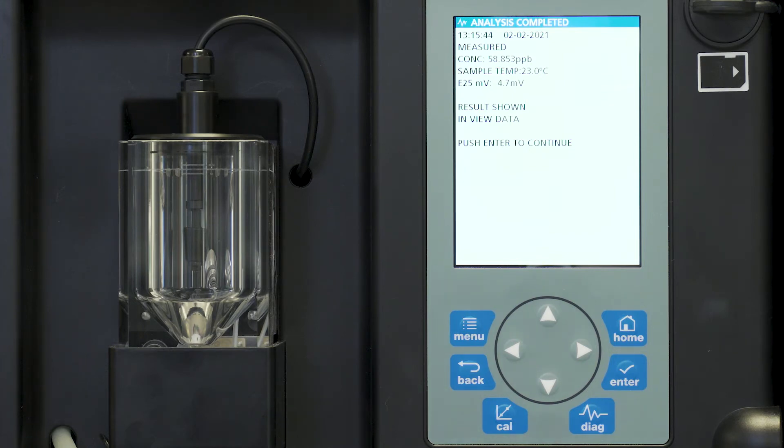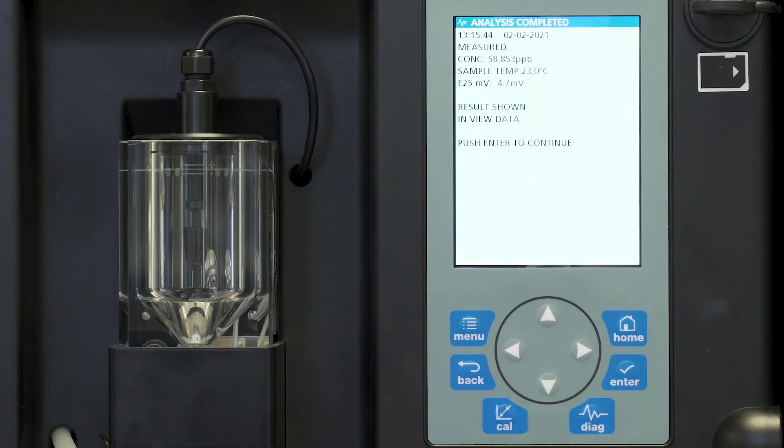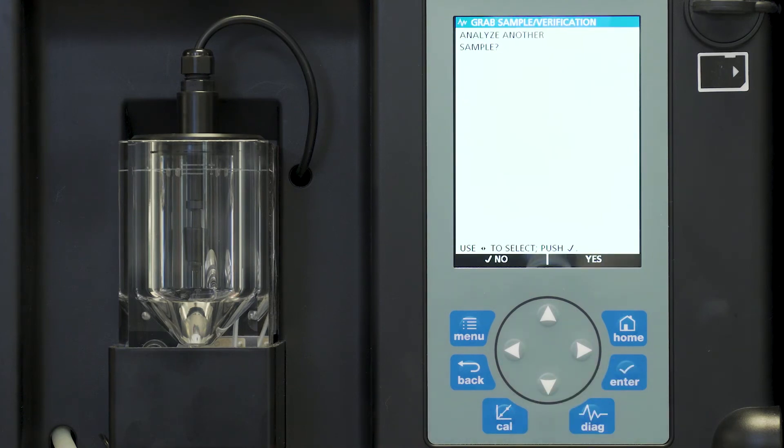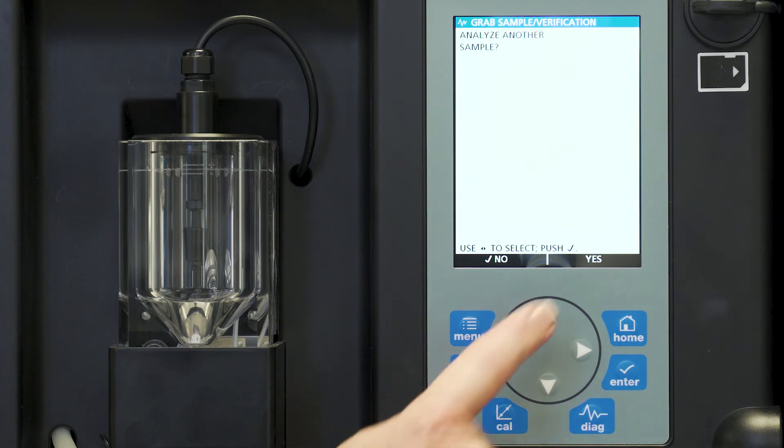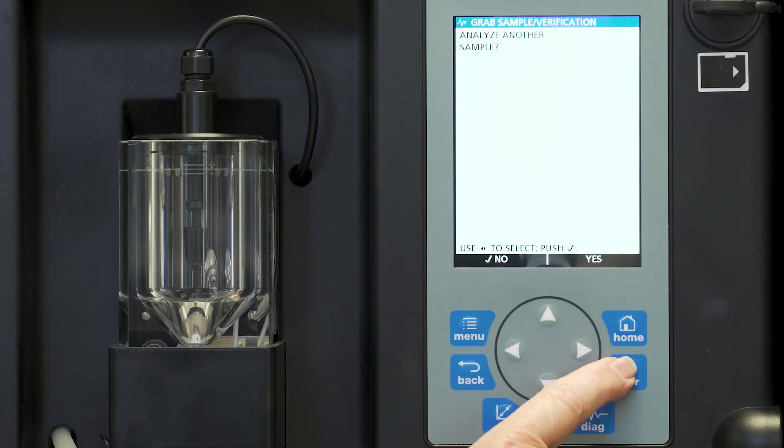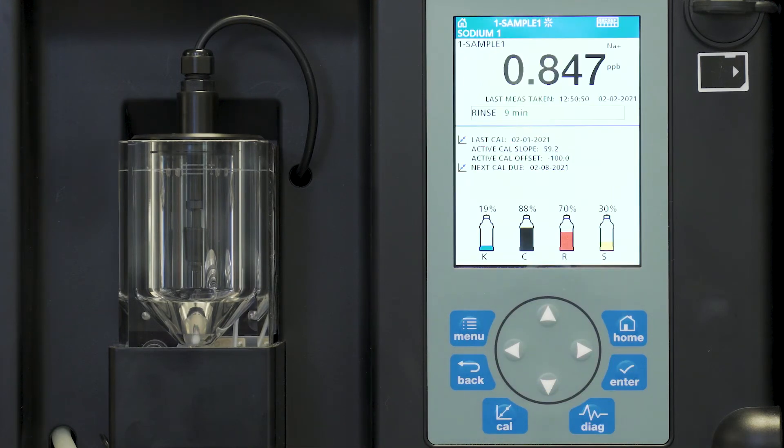When I press enter to continue it now asks me if I want to analyze another sample. In this case no. If I wanted to I would use yes but no. And we just move back to the main screen.